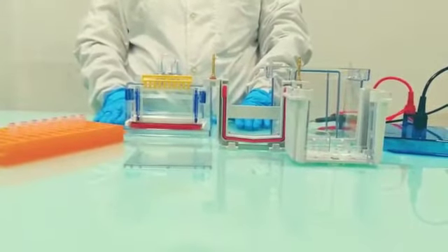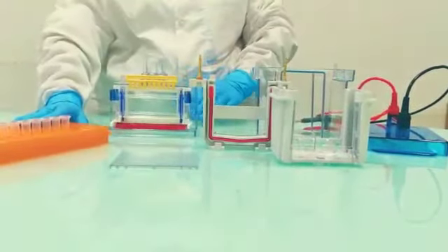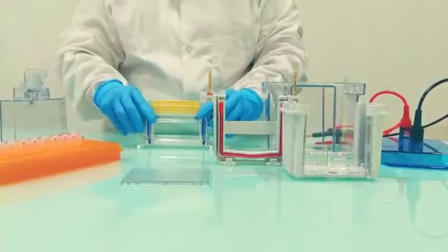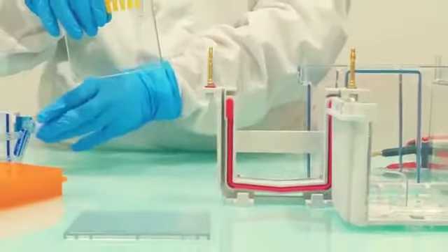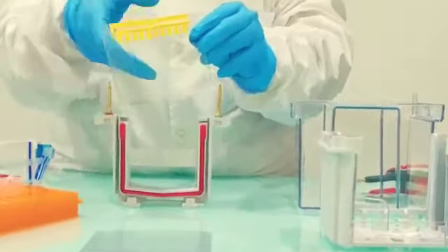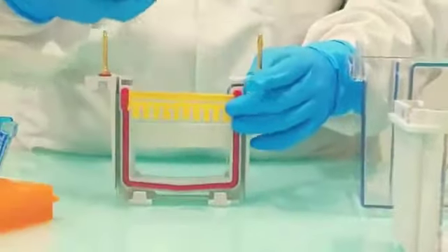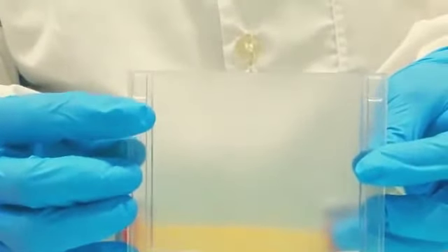To run an SDS-PAGE gel, make sure you have your gel ready, the running apparatus and the samples. Now, to assemble the gel, take the prepared gel. With the short plate facing inwards, place it like this in the electrode assembly. Now, as we will run a single gel, we will use a buffer dam.